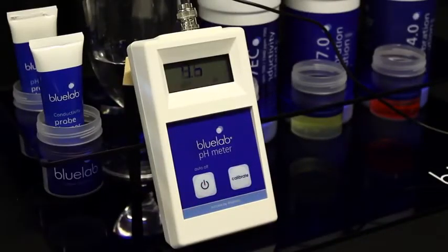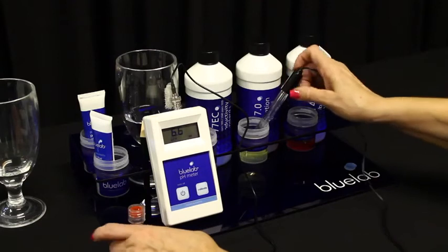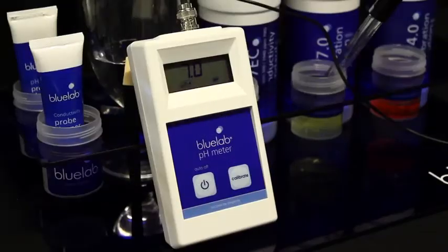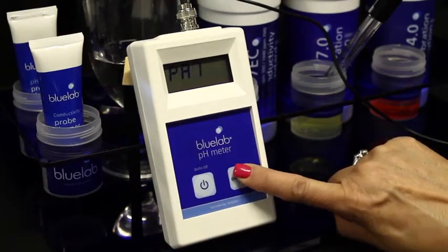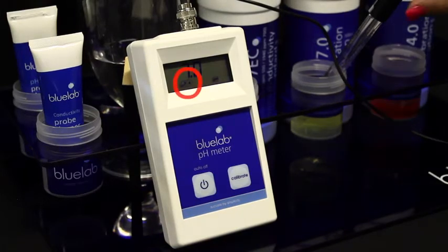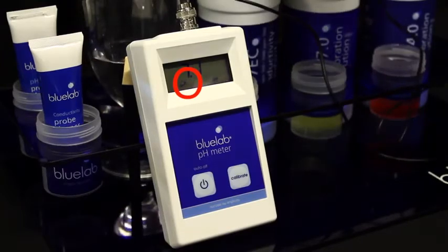Turn the meter on and place the probe in pH 7.0 solution. Be sure to wait until the reading has stopped moving. Press and hold the calibrate button until the display shows CAL. The pH 7 indicator will be displayed, and the pH 4 indicator will flash to let you know that pH 4.0 calibration is now required.